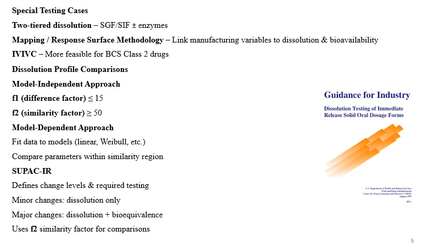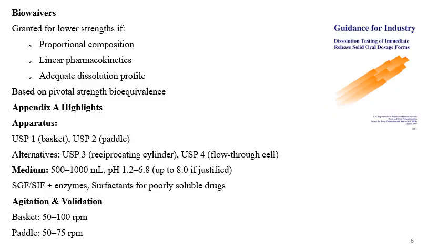For major changes, depending on the formulation, the API, and IVIVC availability, you can go through dissolution and bioequivalence. Also, sometimes some strengths are required to undergo the bioequivalence study, while you can get the waiver for additional strengths. Use the F2 similarity factor and other model independent approaches for the dissolution similarity.